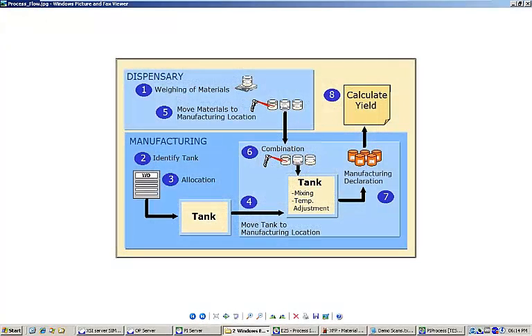Hello, my name is Brandon Johnson, and this video continues my demonstration of the Siemens Somatic IT XFP Manufacturing Execution System platform.